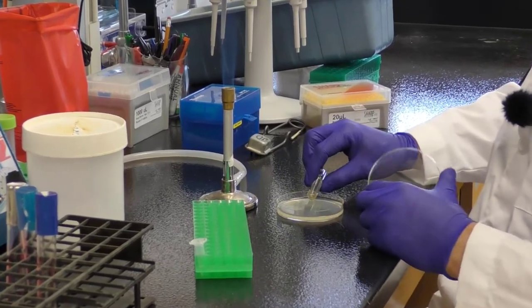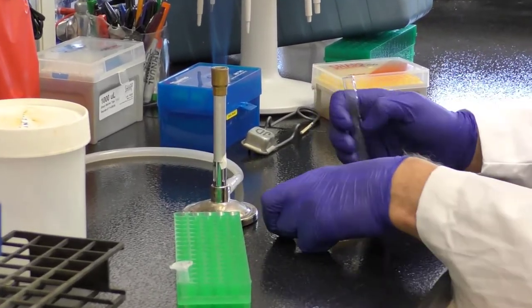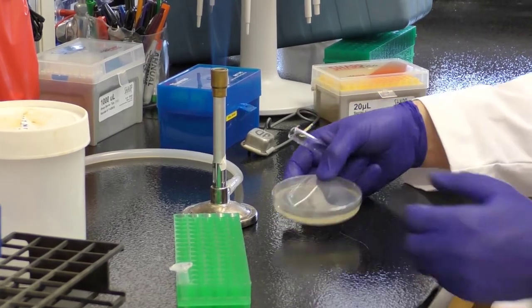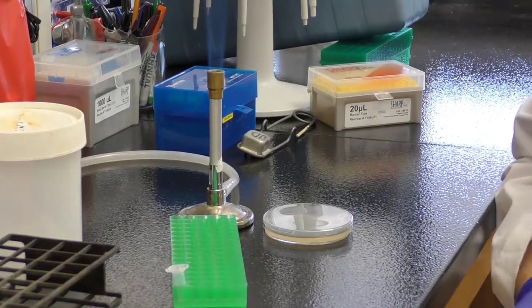And then as before, we just carefully pour in one motion all of that reaction, and we swirl it. We let it set, and then we incubate it overnight.